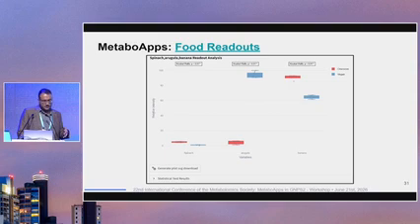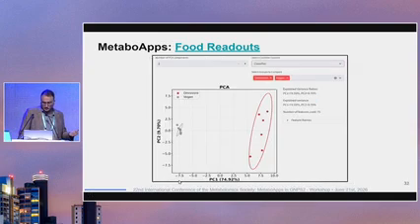So in this case, you can generate the SVG image of these. And also you have the information on the bottom here for the statistical test results, so you can get some hints on how to interpret that data.